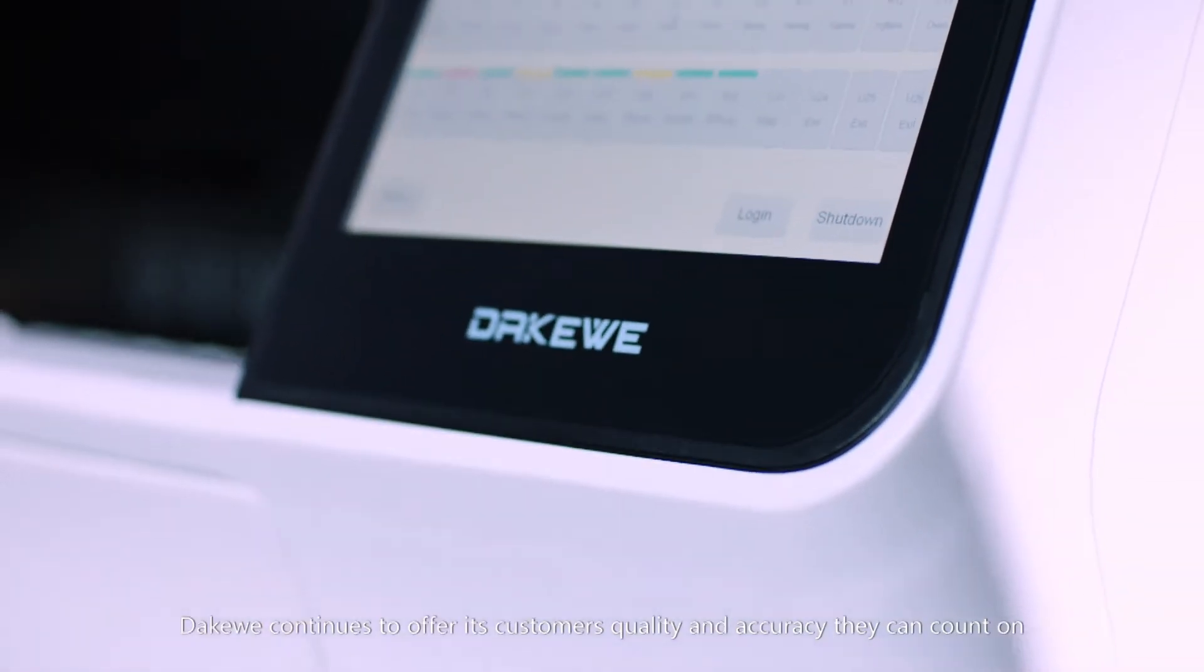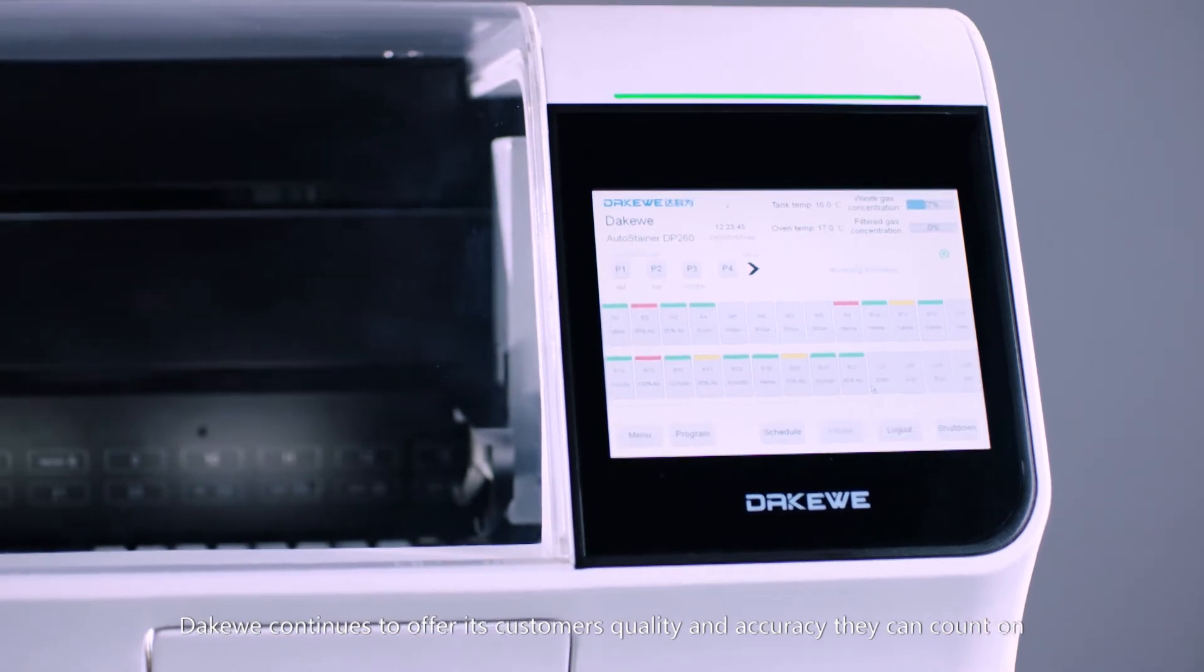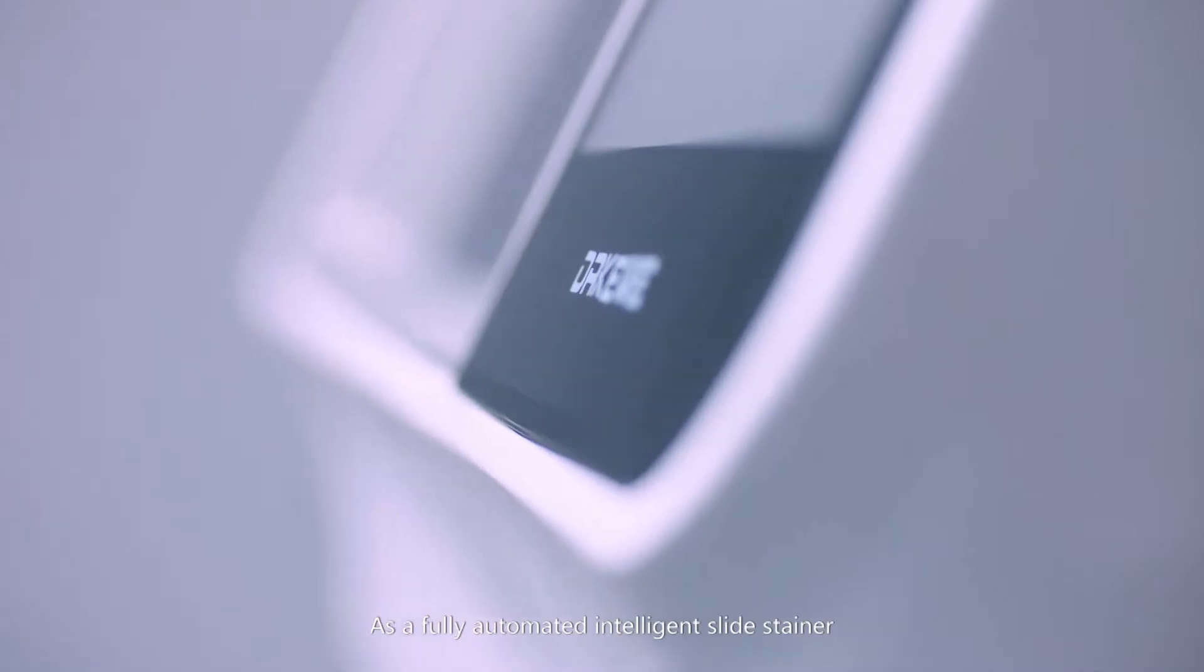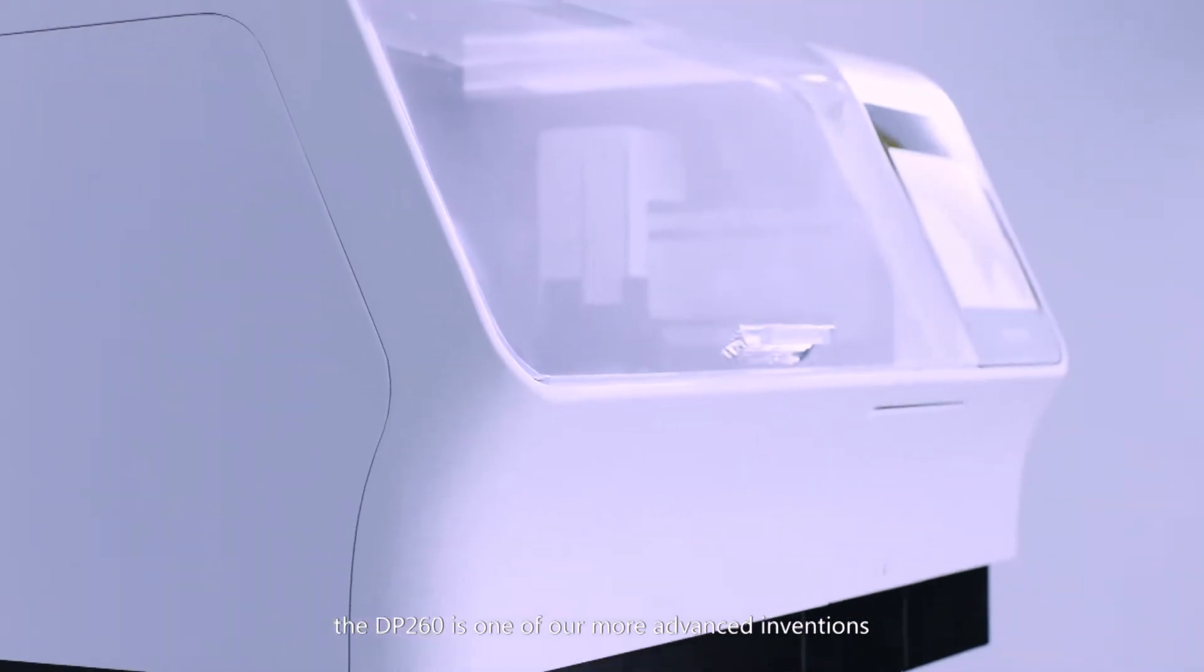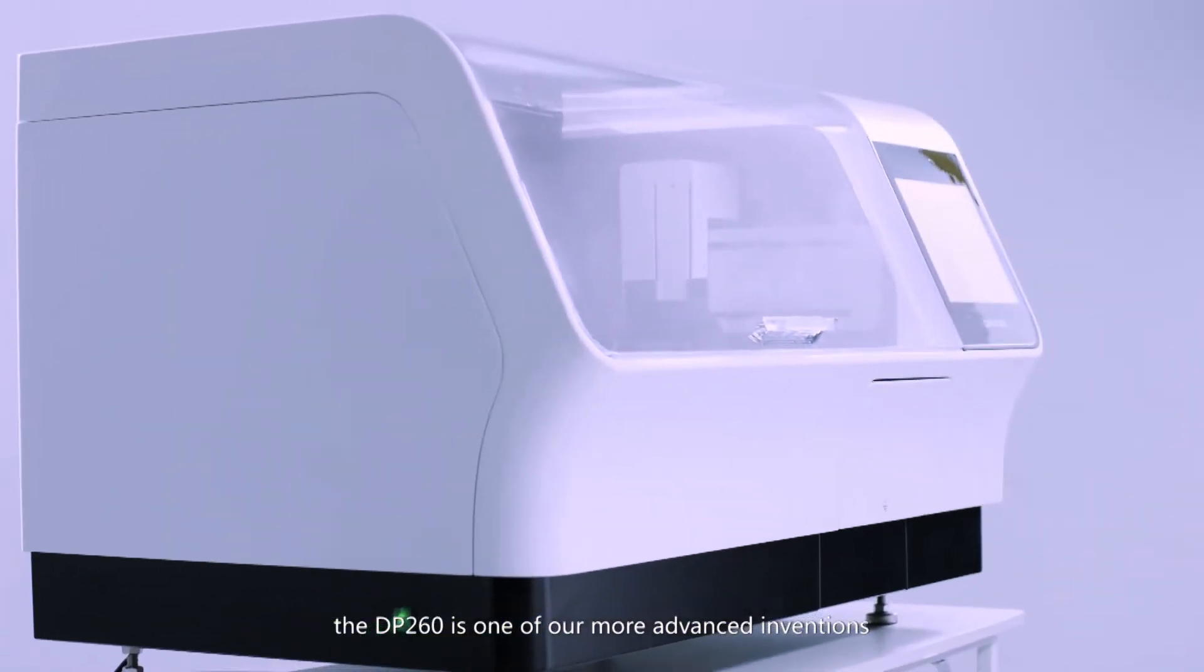DACWAY continues to offer its customers quality and accuracy they can count on. As a fully automated intelligent slide stainer, the DP260 is one of our more advanced inventions.